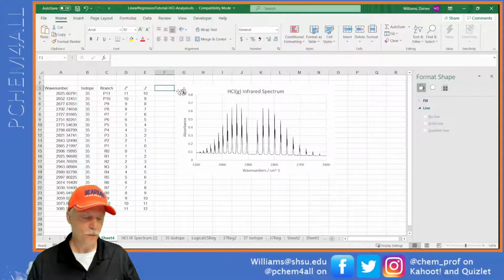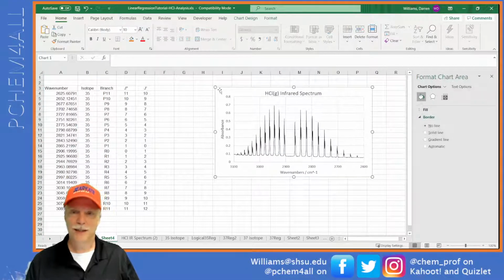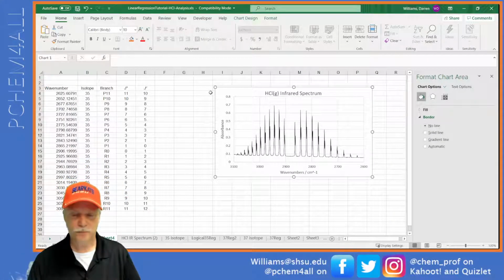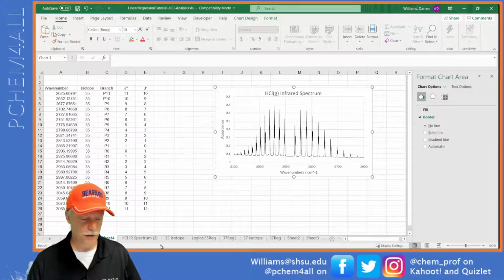Now, we could do a regression analysis to get our B values and all of those terms that we have in that lab handout and in the lecture. Let me go ahead and pull that lecture up so we can get the regression analysis equation. Okay, so I'm going to go ahead and clip that equation out of the lab. I'm going to snip it and paste it into Excel. And so we've got this guy here.